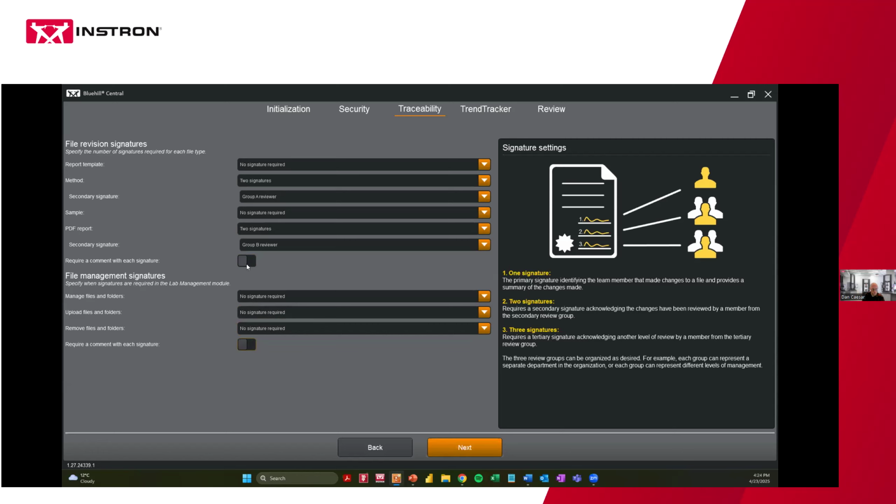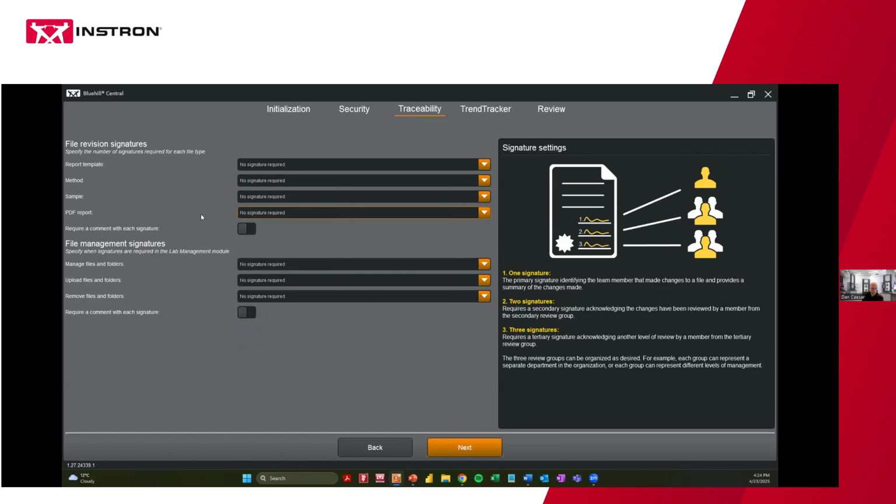Yes or no? And so as I've gone through those examples, I've realized that I'm actually creating a development team. And so these settings around locking down methods, locking down test data with signatures, I probably wouldn't do that. So for the development team that I've started with, it's going to be unrestricted.